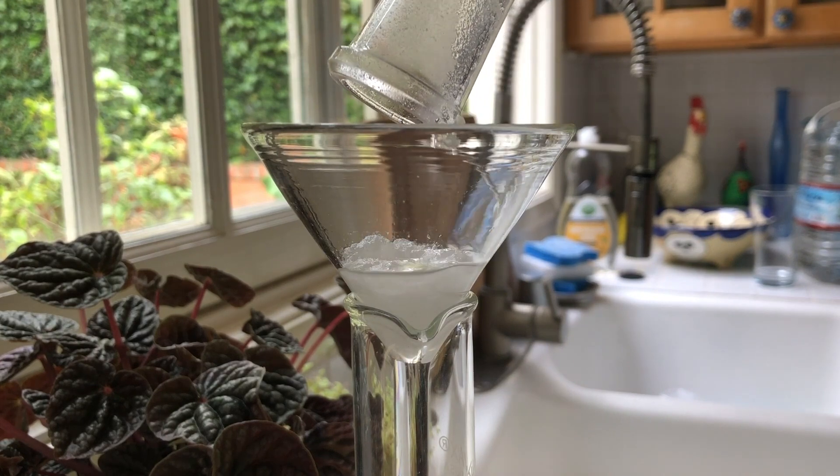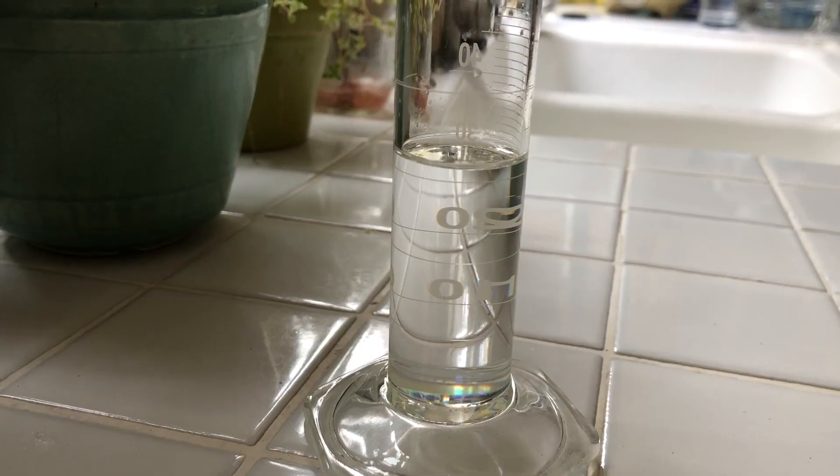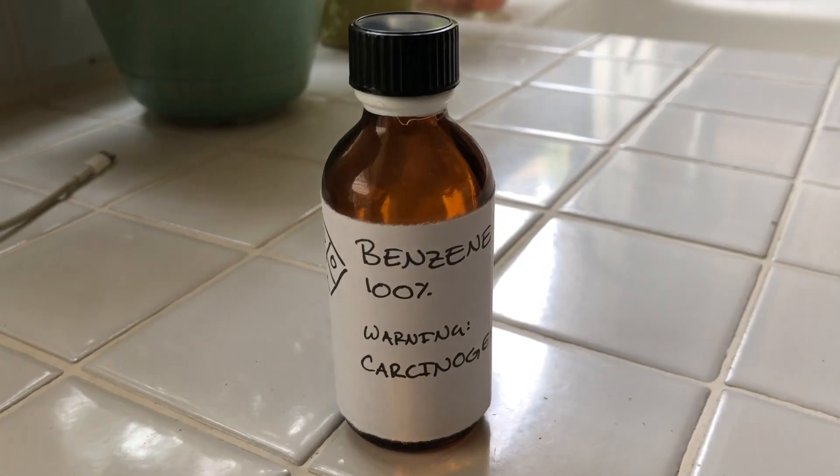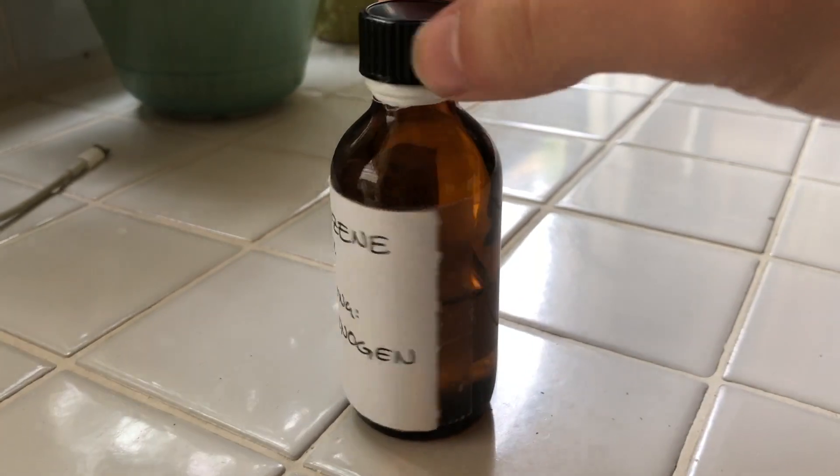I measured 31 ml of crystal clear benzene, weighing about 27 grams. This corresponds very well with the density of benzene. I poured everything into a storage container and labeled it appropriately.